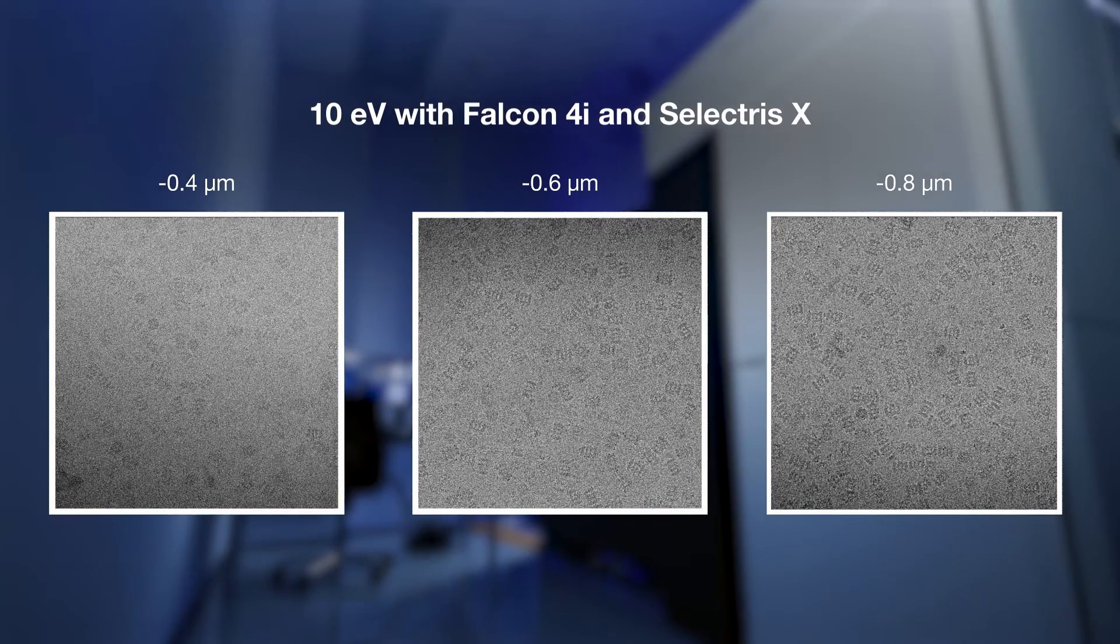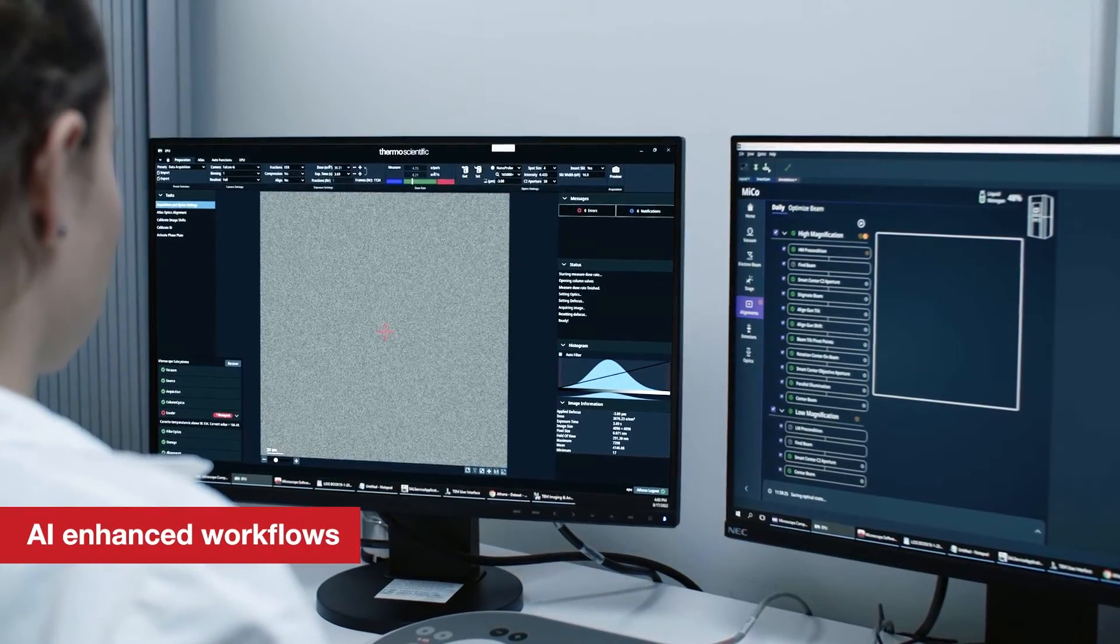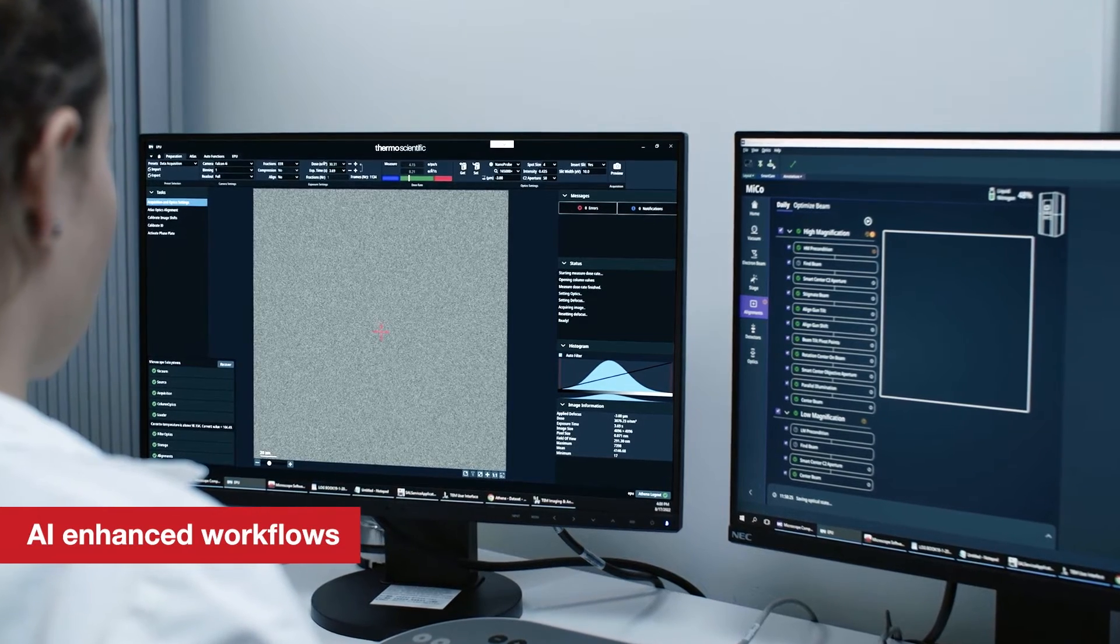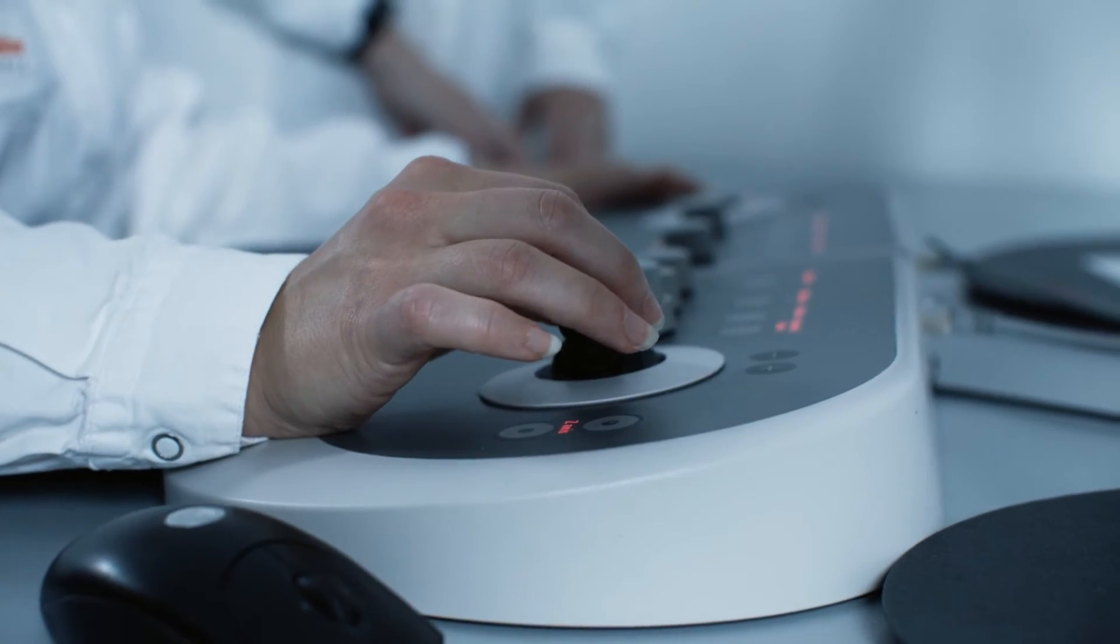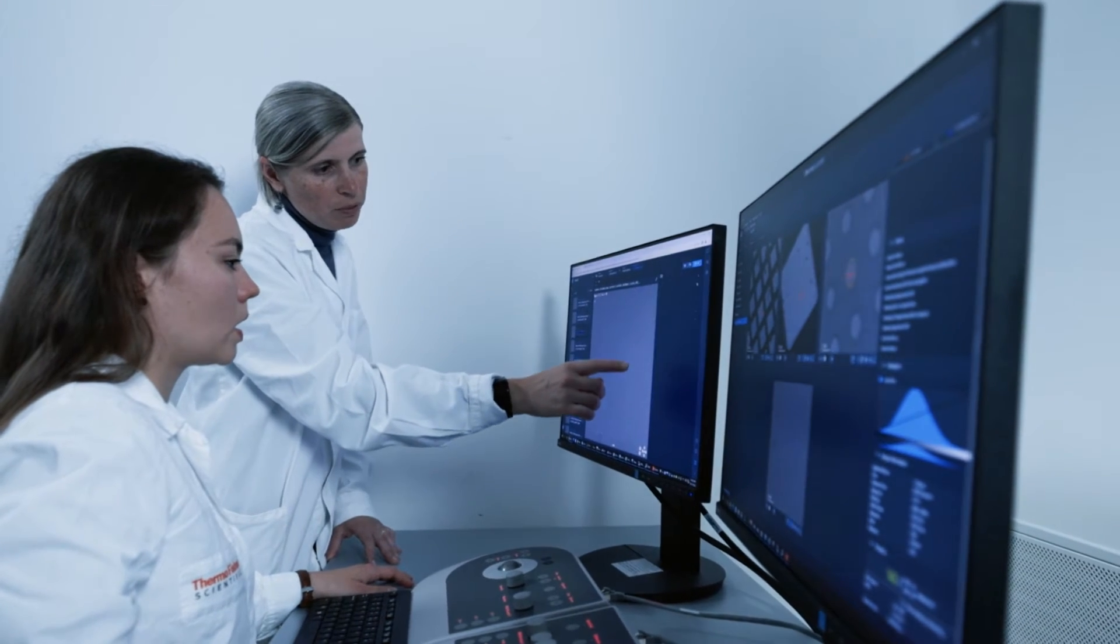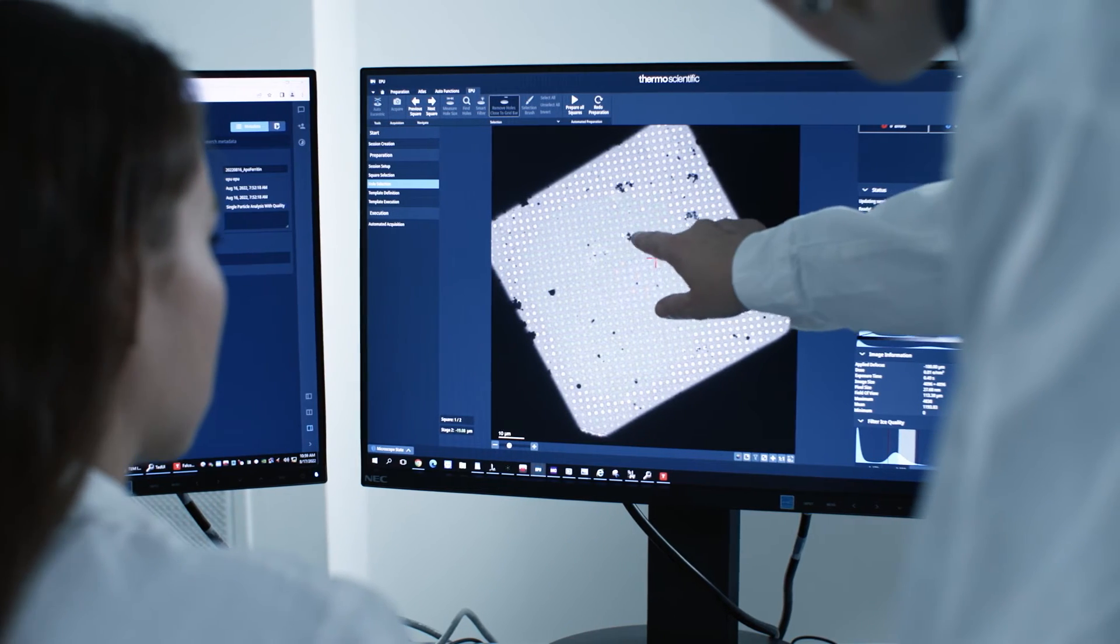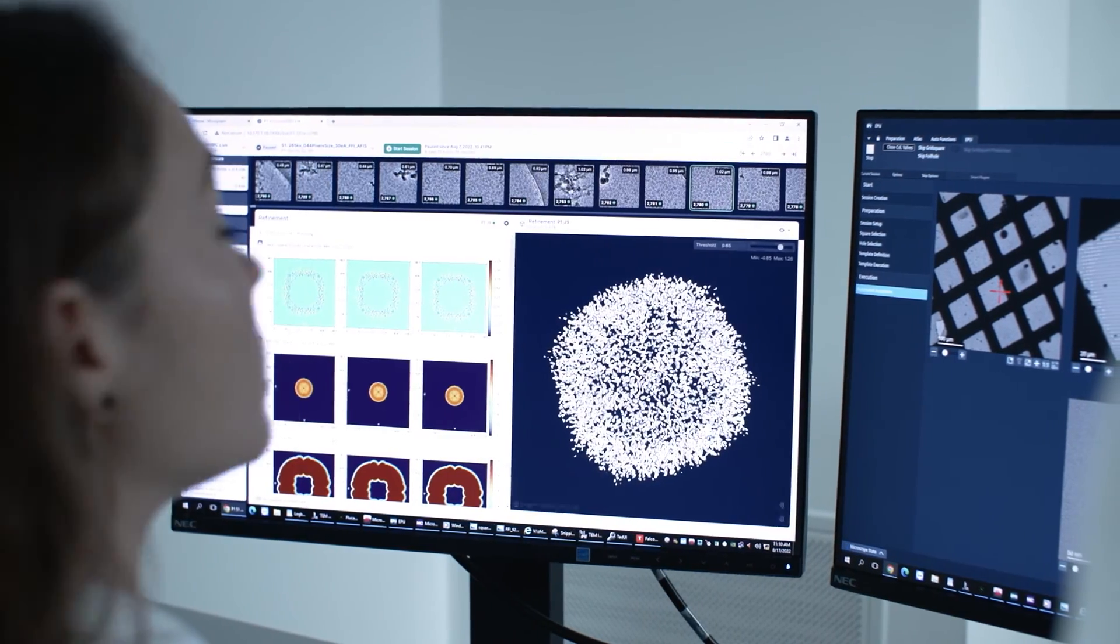Finally, Thermoscientific Smart EPU software is a leap forward in automation, eliminating many repetitive tasks of single particle analysis through artificial intelligence. Its intuitive user interface and suite of monitoring features makes cryo-EM easier to learn and experiments easier to manage.